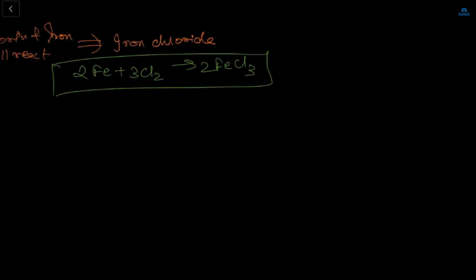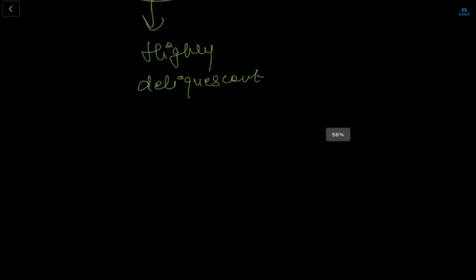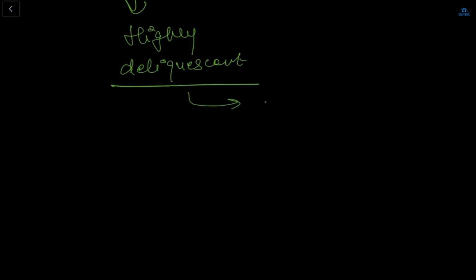Okay, so this FeCl3 is highly deliquescent. Now, what is the meaning of that? Do you know? No. So this means that it will absorb moisture from the atmosphere and it will dissolve in that. See, what will happen?